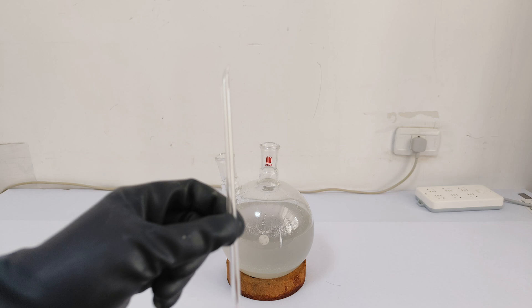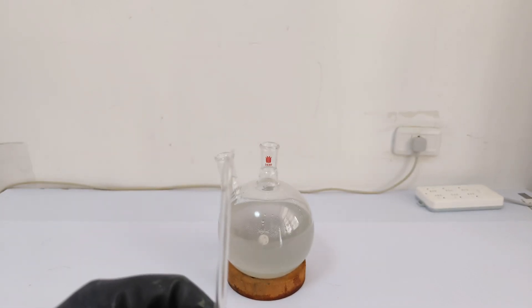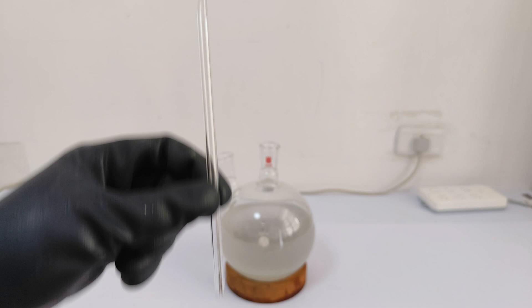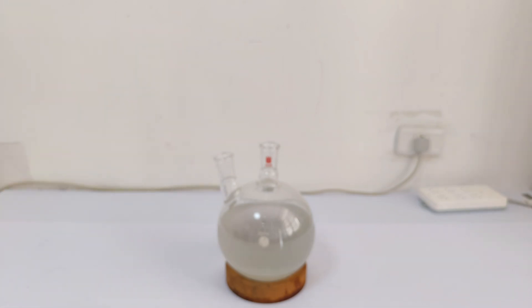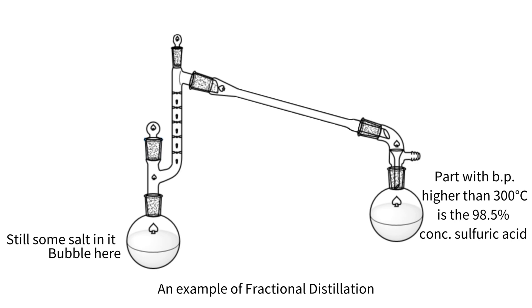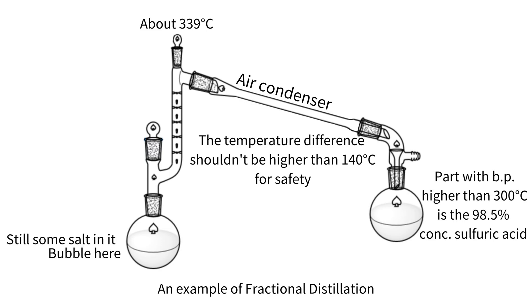So to avoid this, what's needed is a glass tube with one end sealed. When boiling, the air in the tube just comes out and helps with bubbling. The reason to use the air condenser is that the boiling point of acid is 339°C, while the water is typically 30°C. The high temperature difference would make the glassware crack.